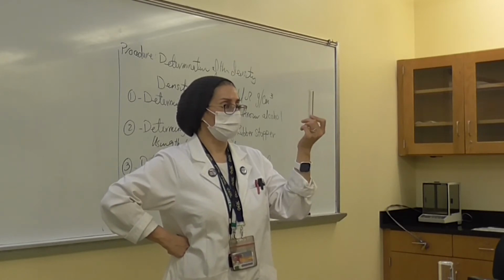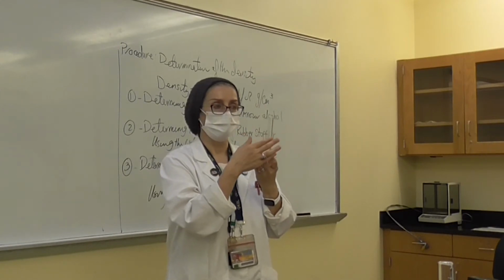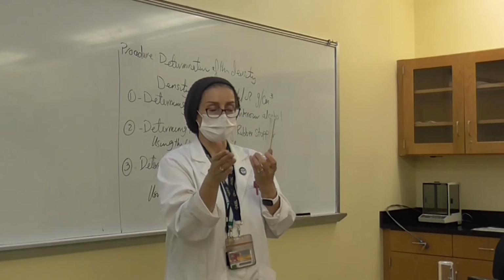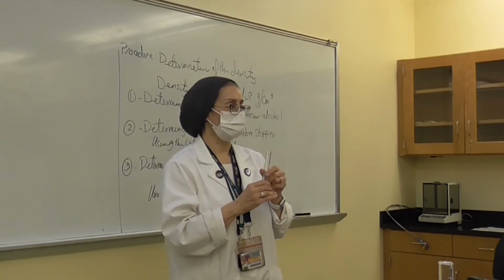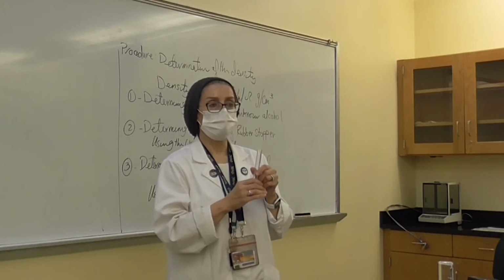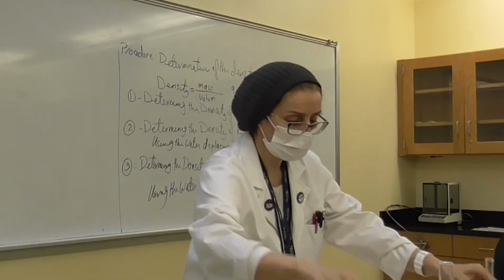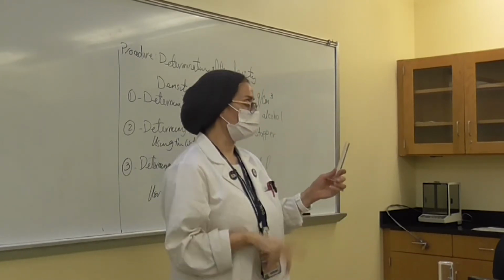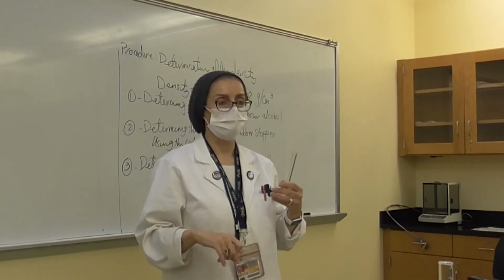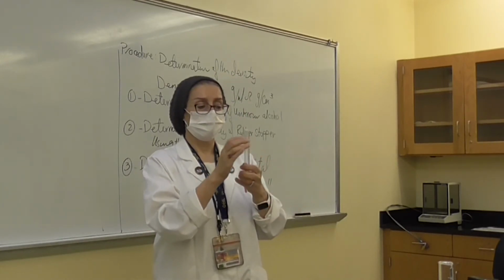The cylinder is graduated, so you know how many milliliters you are going to measure, right? It says between 5 to 6 on page number 3. That's the procedure. You got it, everybody? So measure it when it's empty, all right, on the scale, either this one or the 3-beam. And then you're going to pour 5 to 6.